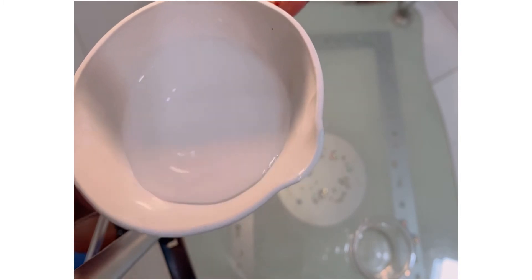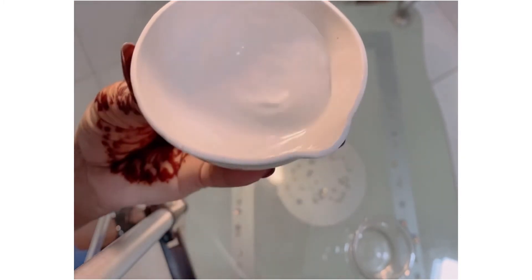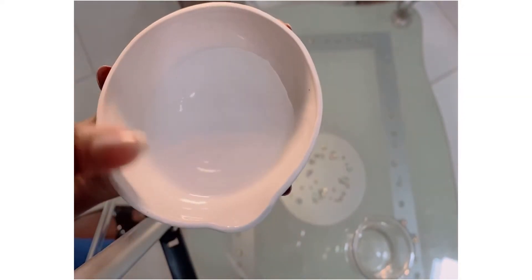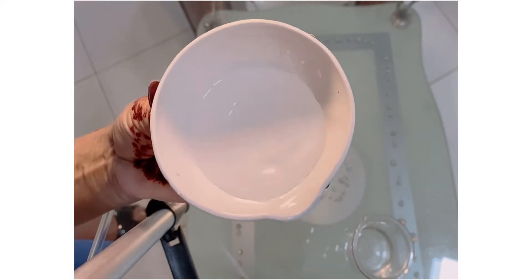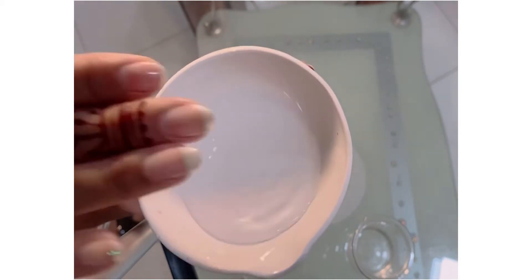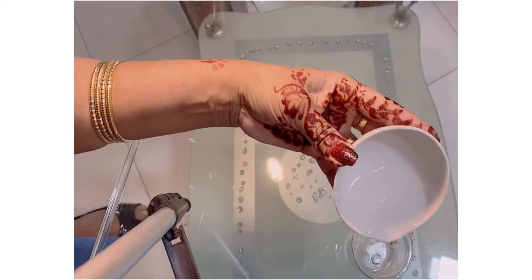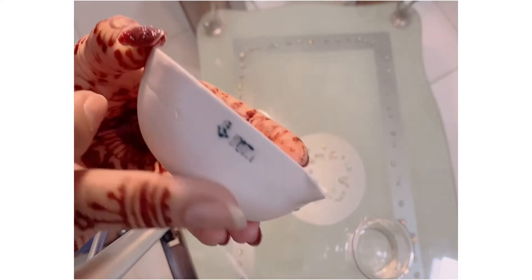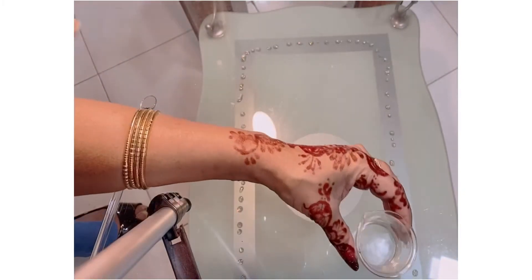Whereas the shape of evaporating dish, now if you talk about the shape of this evaporating dish, it helps to progress evaporation in different ways. Like it is basically flat, it has a flat surface. I pour it back - it has a flat surface, right? So it helps to evaporate solvent easily as compared to the other glass apparatus, as compared to this beaker.